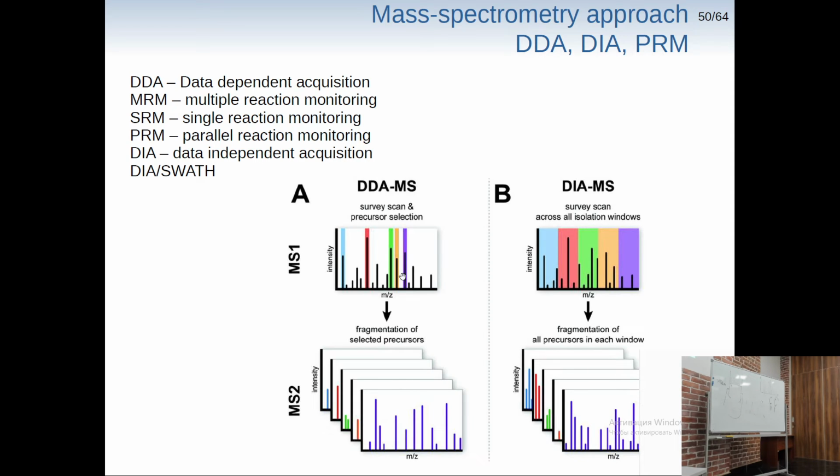So, the last big part of our lecture is so-called data-independent acquisition. What we've done so far, we've put some rules in place to select one precursor and then get some fragmentation out of it. But what we can do is divide our whole mass-over-charge range into small bands and fragment everything that is inside one of these bands, then in another band. And if this can be done quite rapidly, we can cover the whole m/z range with some reasonable window in just 1 second.